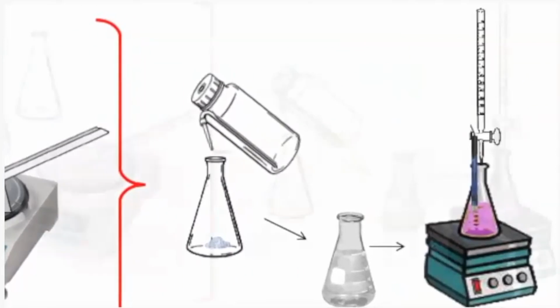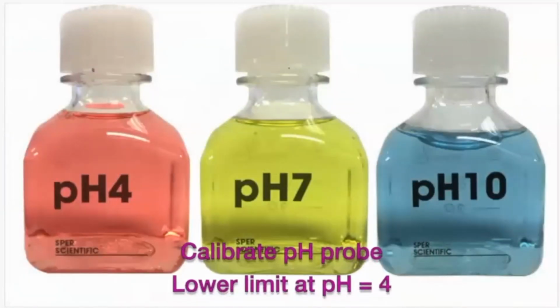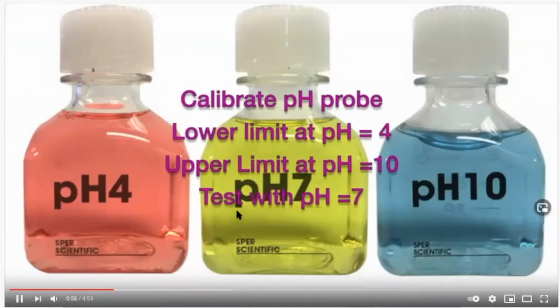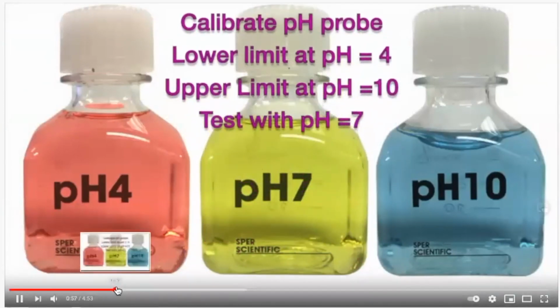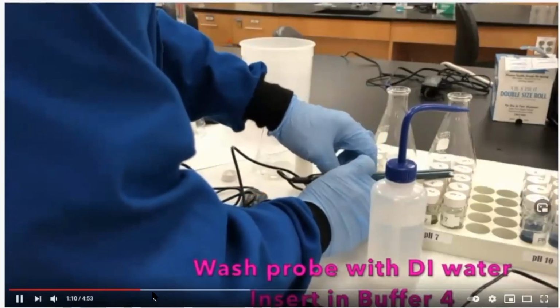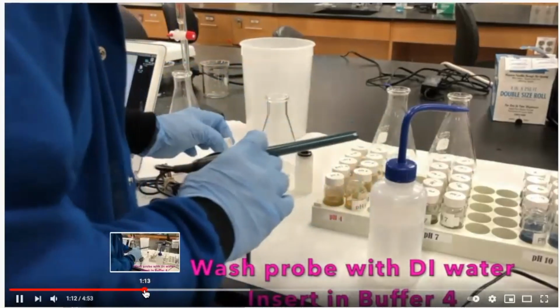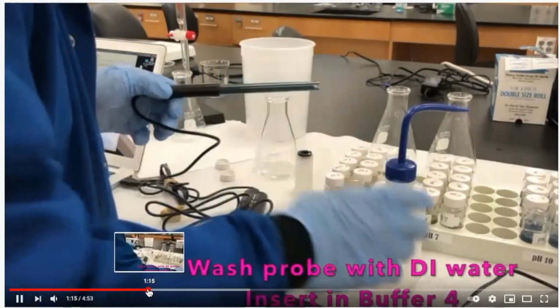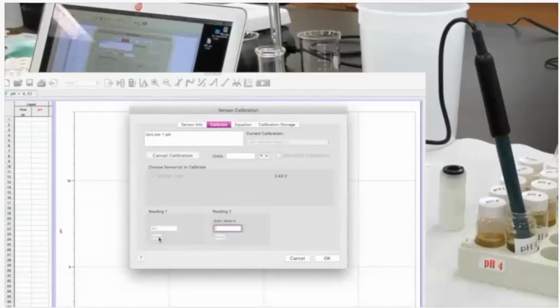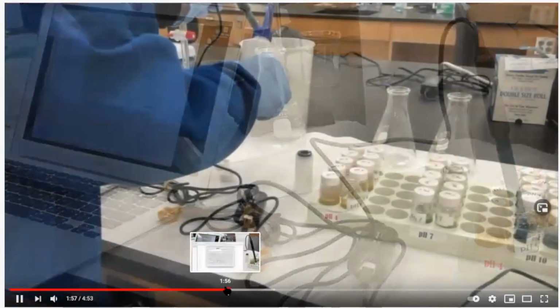But before you do the titration, you got to calibrate your pH probe at 4, 10, and 7. And so I think this is the calibration procedure. Make sure you take a note of that because if it's not properly calibrated, your pH will be off. So this is the calibration procedure. See, I'm calibrating at pH 4. You guys did activity number 4B, in which we did the same thing. So take a look at that.